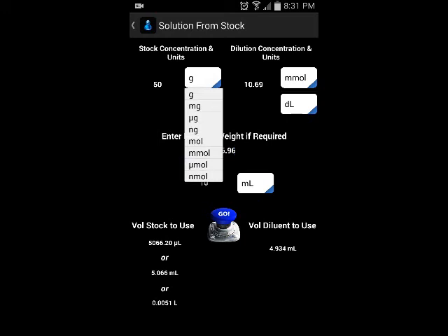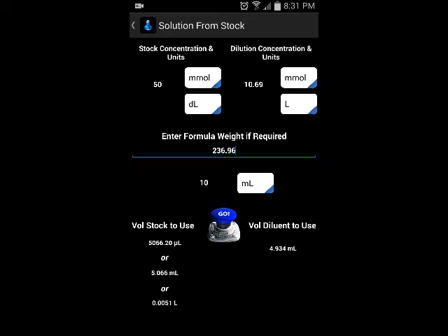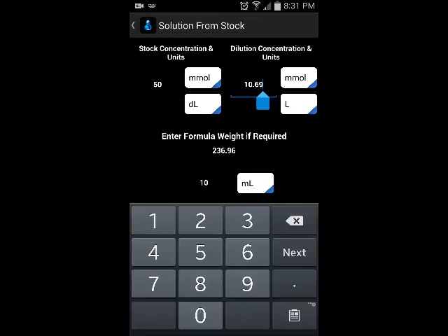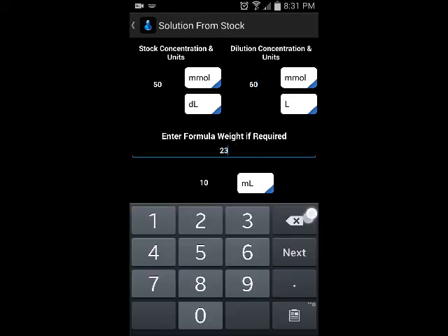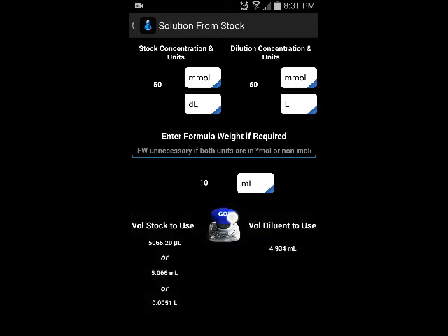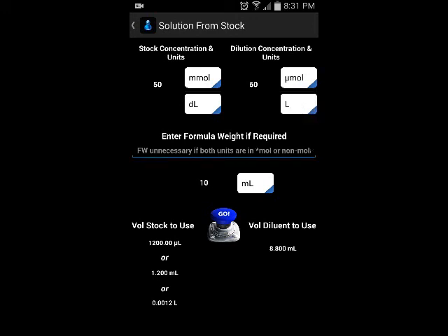But what if you actually did have the same units? If we're going from, for instance, millimoles per deciliter to millimoles per liter — going from high to lower concentration, which is the only way to work — notice I have molar units on both sides, so I shouldn't need the formula weight. And yes, it works just fine. You don't need the formula weight when you have molar units on both sides, even if the specific molar unit differs, because it's all a ratio. That pretty much wraps up this portion.